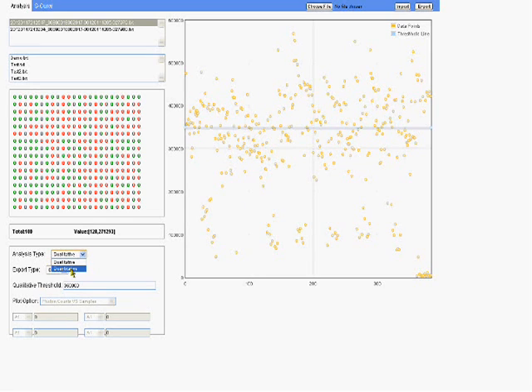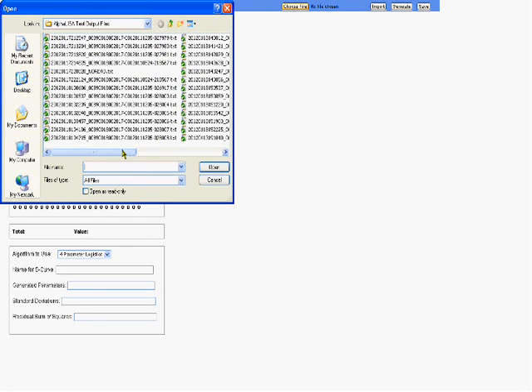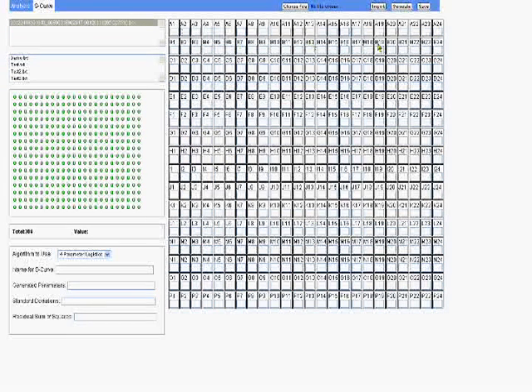And for the other type of curve, to use that, you'll need to make an S-curve first. S-curves are the standard plot that you'd like to test your data against. And so what you'll need to do is choose a file that you'd like to base the standard S-curve off of, and you can import that. Once you've imported, you can select it, and you'll see a well by well basis of the values. Leave it blank if you don't know the concentration of your control well, or if it isn't a control well. And if it is a control well and you know the values, you input it wherever those wells may be.